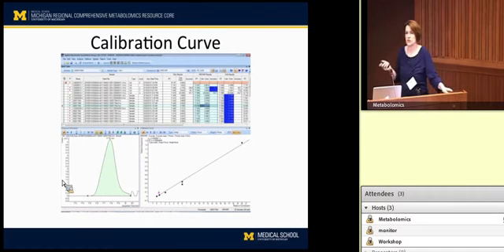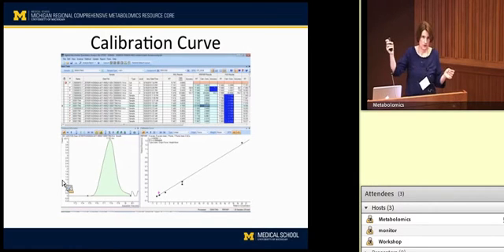accuracy calculation here. What we're looking for is this: if I ran this calibration curve and created a line from it, and then I went back and submitted the same exact sample to that calibration curve again, how accurately is it telling me what I put in? So I put something in, I make an equation that puts it on this line, and then I put it back in again, and how accurately does it report back the original amount? That's really what we're looking at here.